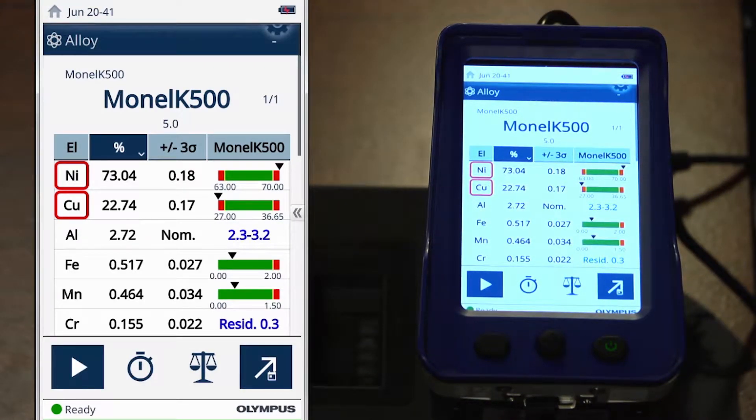Let's increase our value to 6 and retest our sample. You can see now that we've successfully identified the material as Monel K500. You'll also notice that below the sample name there's a small value, 5.0 — that is the match number. Since we previously specified the match number had to be less than 4, we obtained no match. Now that we've increased our match number to 6, we're able to obtain a match.